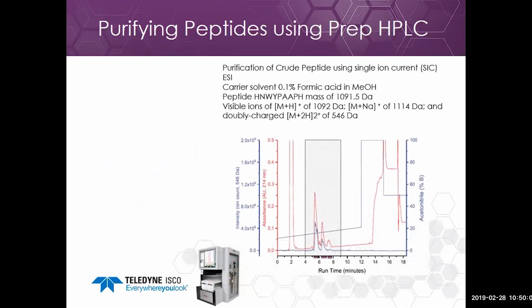We did the same thing using our ACCQPrep HPLC system. So I'm not going to go into the details, but you can do the same thing on there. And here's the analytical HPLC of that pure fraction. So you can see that is one compound.